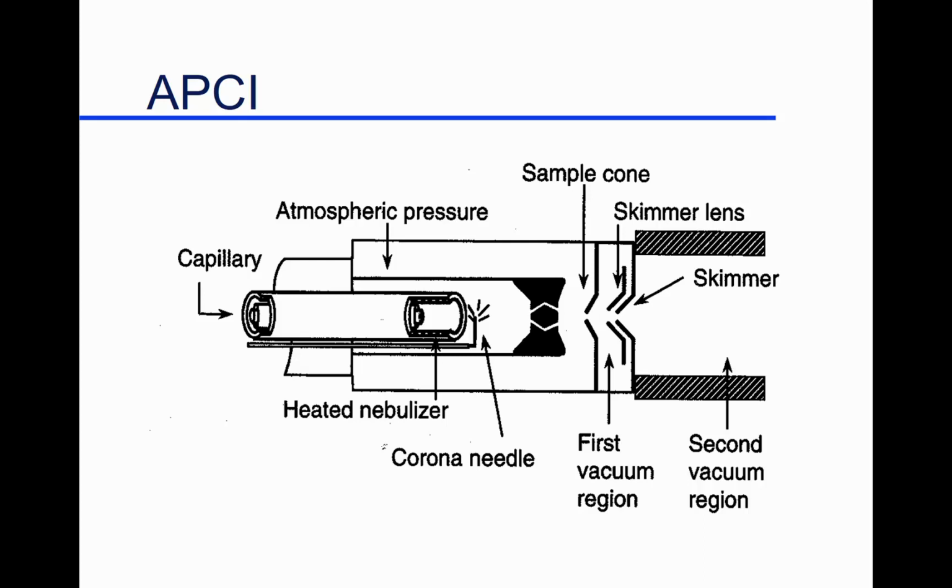In our case, what we use it for is we want to analyze flavor compounds in a person's breath. And so we'll actually take you, set you in front of the mass spectrometer, put the little tube up your nose very gently, and we will monitor what you breathe. You'll take a food into your mouth, chew it up, swallow it, and the mass spectrometer will sample your exhaled breath. And so you can monitor the flavor compounds in your breath from the food you just ate. Really fascinating technique.